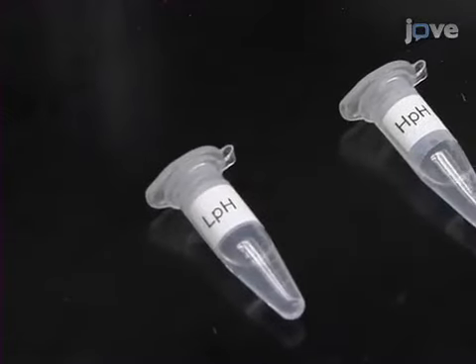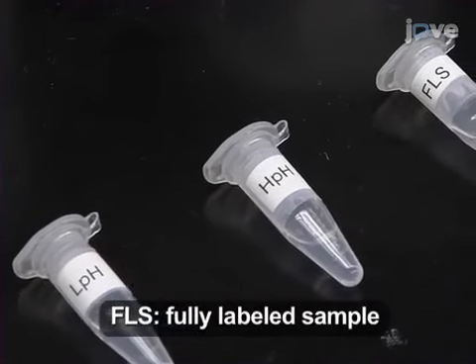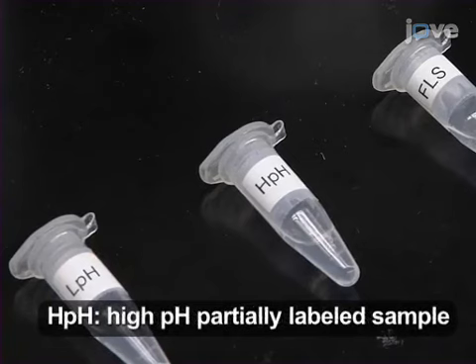Label 3 1 milliliter microcentrifuge tubes with FLS, LPH, and HPH.